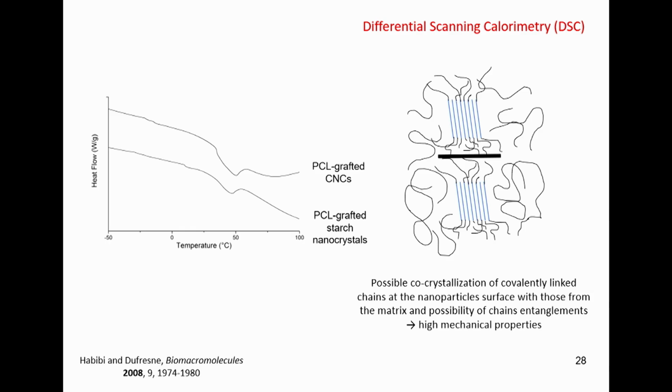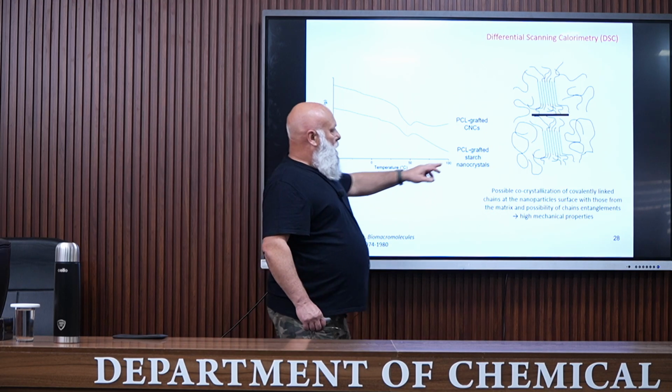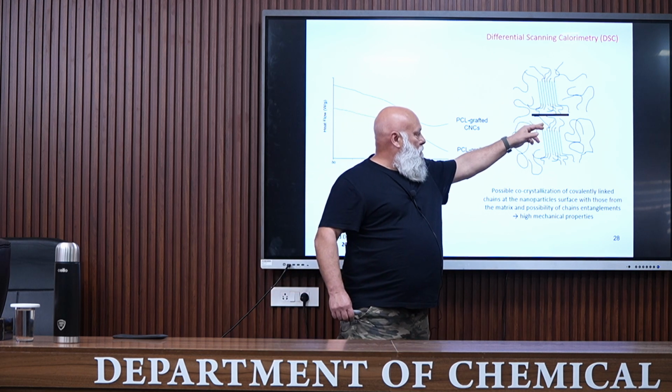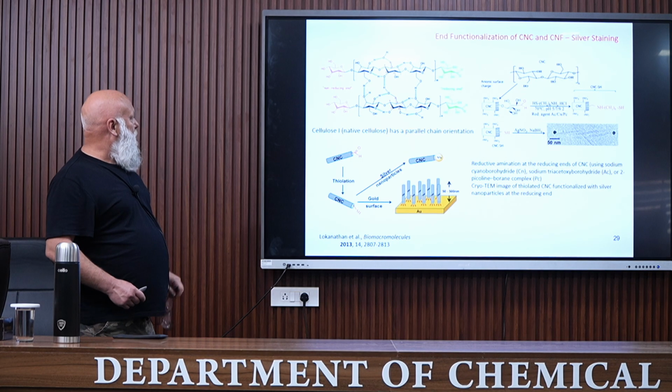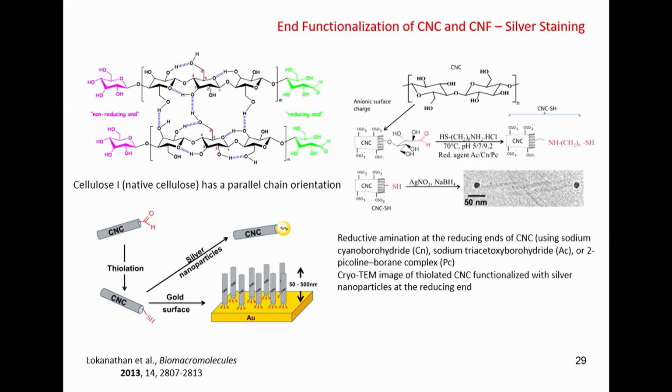What we can expect, and we observe this, I will not show here, is transcrystallization. Crystallization between the grafted polycaprolactone molecules and polycaprolactone molecules from the matrix, which leads, of course, to strong interaction at the interface. So this is maybe a little bit specific.